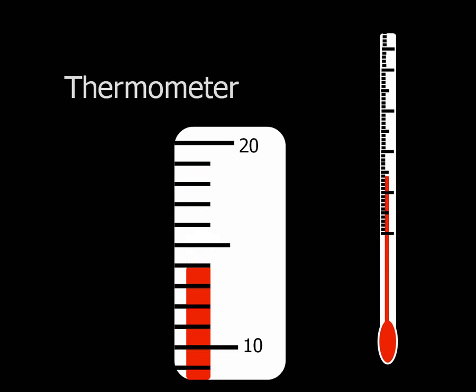It's important to realize that if the temperature is right on the line, you have to indicate that to the tenth of a degree. So this reading right here would be 14.0.